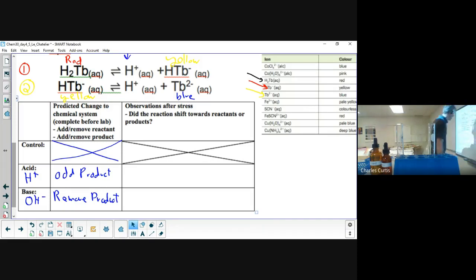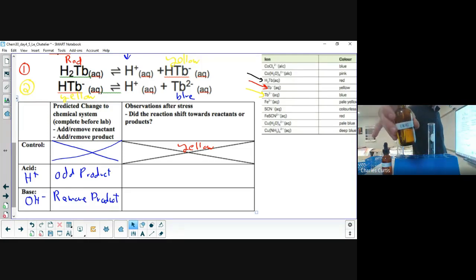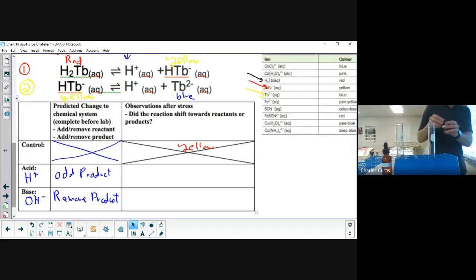Okay. So let's see what happens. Again, I'll just make a little note that our control is yellow. So we're going to start with the acid. This is 0.1 mole per liter hydrochloric acid. The Cl- that I'm going to add will do nothing. Chloride isn't in the reaction, and chloride doesn't precipitate anything.